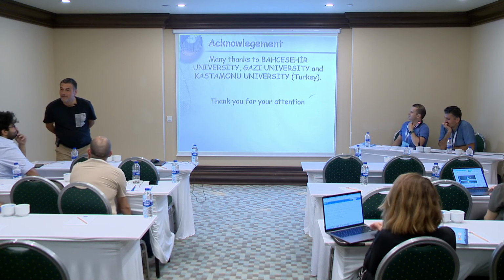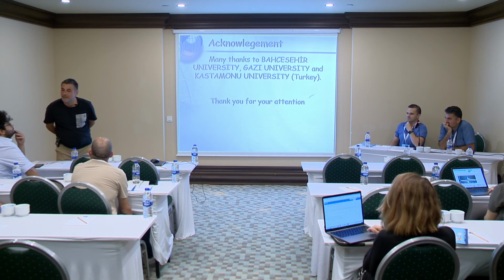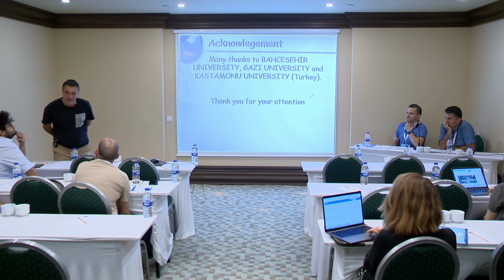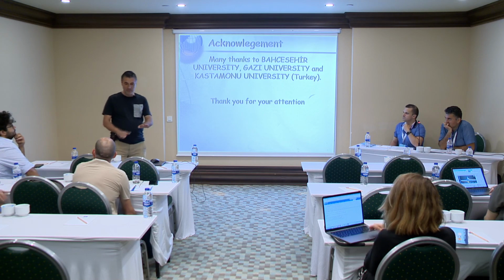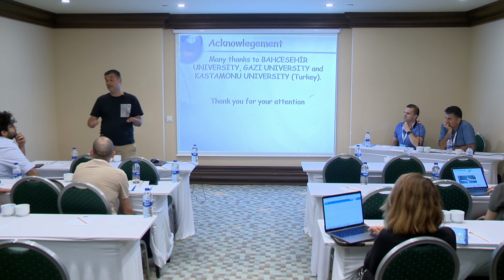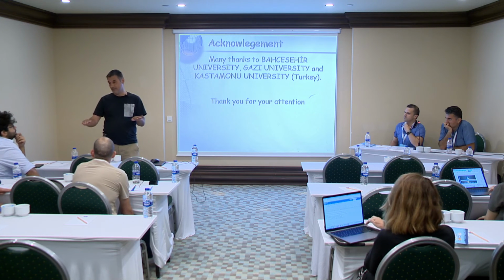Yes, thank you. When you prepare your samples for X-ray diffraction, do you remove the rods from the substrate, or is it all together? We prepared two different samples. One is just nanorods, and the other one is on the seed layers.